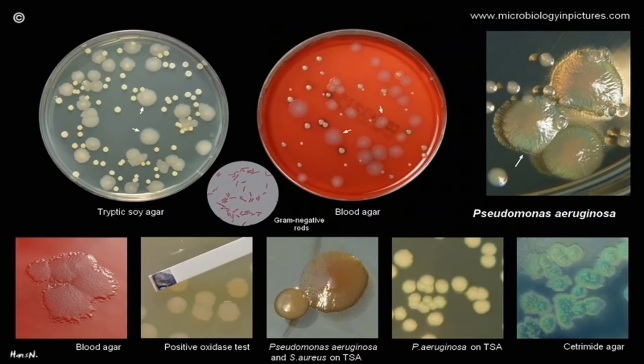Okay, next we have Pseudomonas aeruginosa. So Pseudomonas aeruginosa, it's a gram negative here. So it's also rod, gram negative rods, and they have polar flagella.